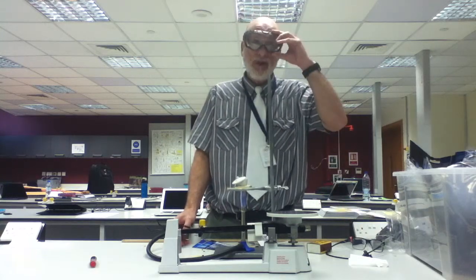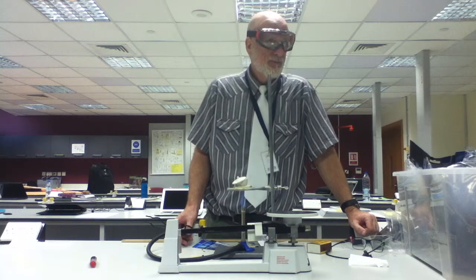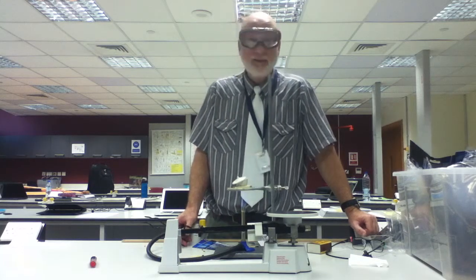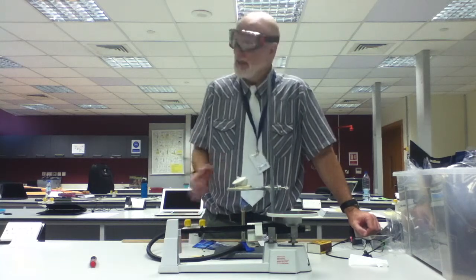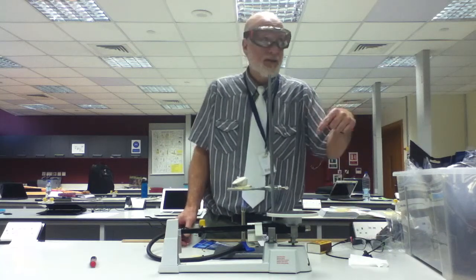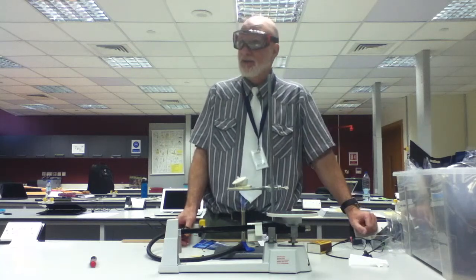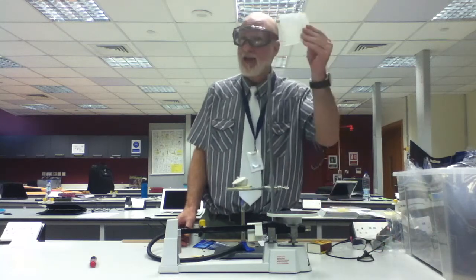It's a very, very common mistake. Understood? Because how are you going to find the mass of the magnesium oxide? It's a powder. It may stick to the inside of the crucible. It would be very difficult to take all of the powder out and put it on the balance. Do you want to put a hot crucible on a paper towel?